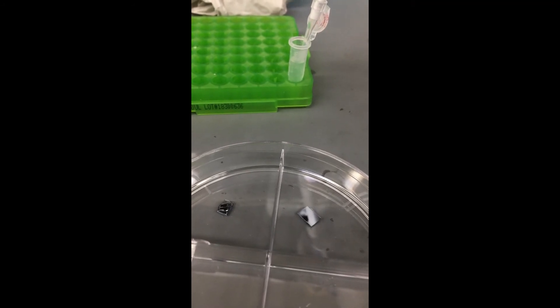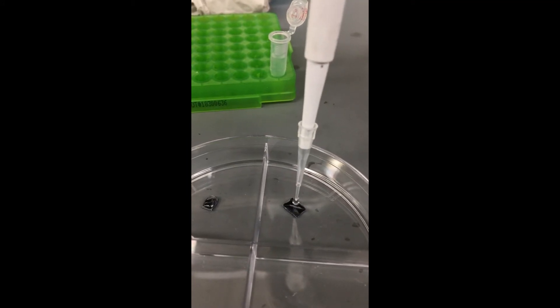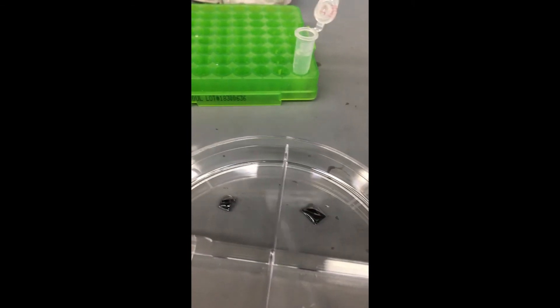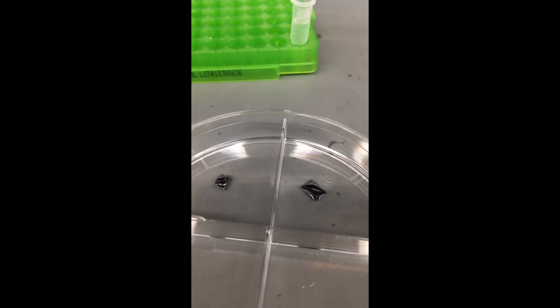I'll do that for the other one as well. Now I'm going to incubate these and let them stay like this for about 20 to 30 minutes.